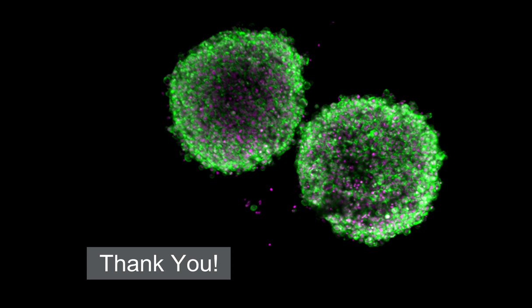Oh, yeah. So towards the beginning, we looked at a couple of different models. One where we're just using a standard round bottom 96 well plate. And we see that when we seed adherent cells into that type of dish, the untreated round bottom dish, sometimes we'll see multiple spheroids form. We'll see multiple larger structures form, but it's not just one round spheroid.